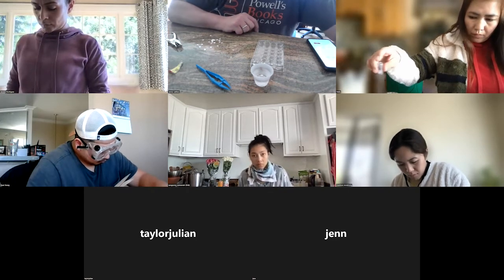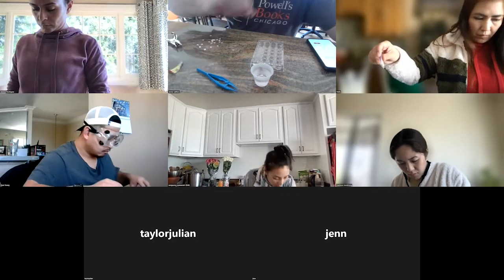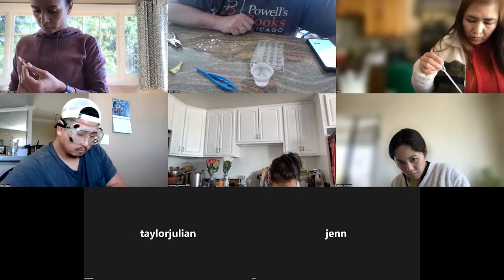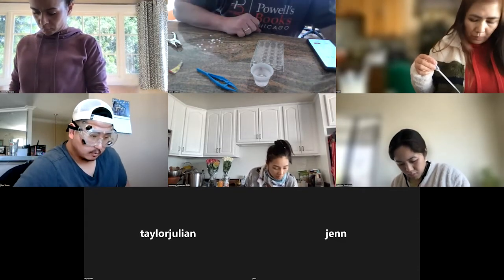Yeah, the first one I put in there, I think I may have pushed it a little too hard. It may have actually stuck it to the bottom somehow. So this one I just let sink by itself.